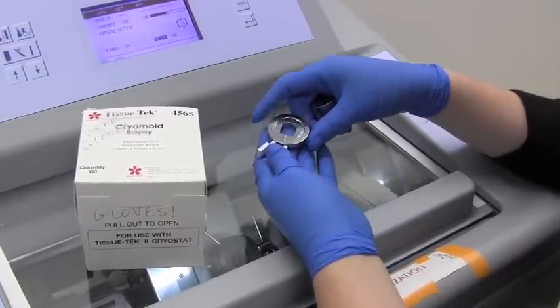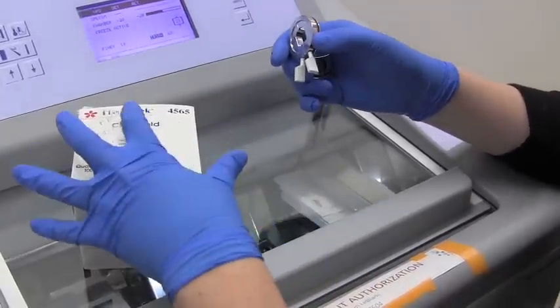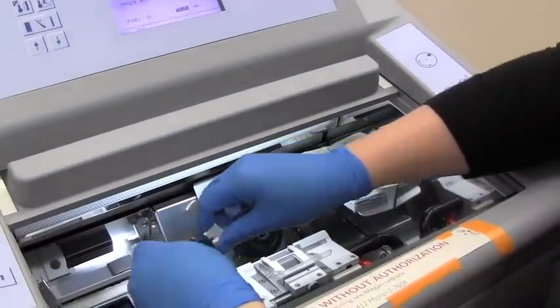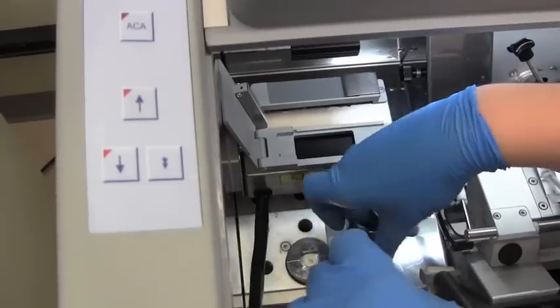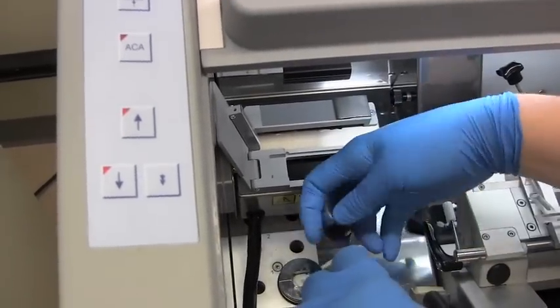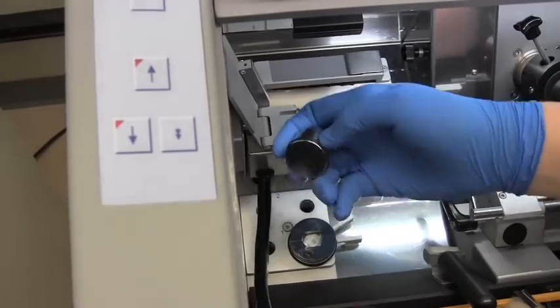Or you can do it one at a time, which uses this setup, which is something that comes with the actual cryostat. What you would do is pour your cryo matrix into this weighted circle, pour the cryo matrix in, put your sample in, and then hold it down with this weight. This is pretty hefty. Hold it down with the weight.